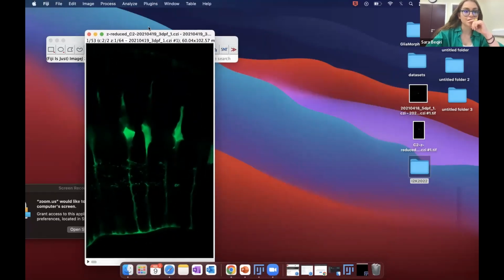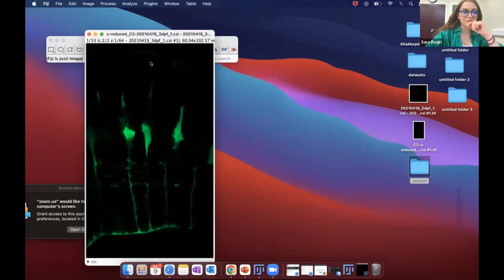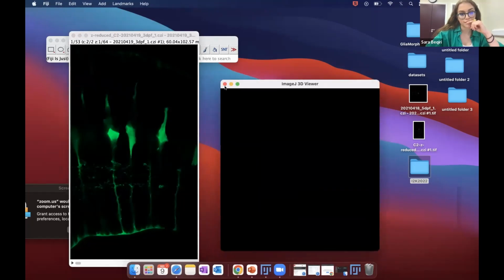Okay, we need to be patient. My laptop is running Zoom and Fiji at the same time. Okay, let's try again.